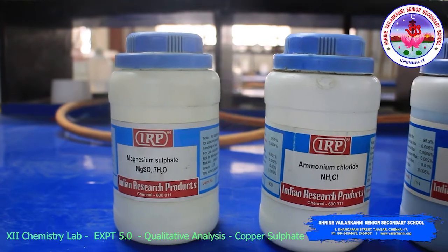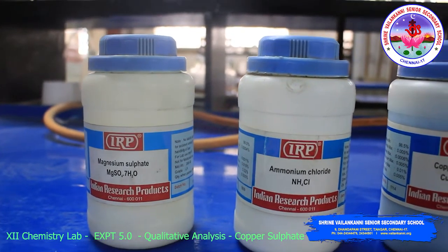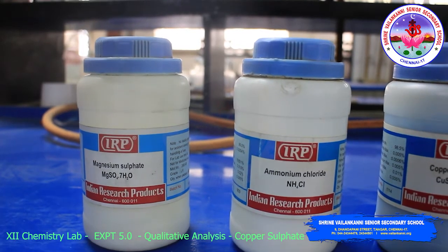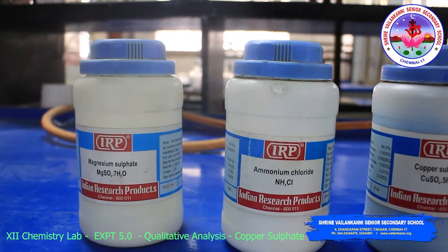Students, we will perform these salts. Usually in the examination we don't tell you which salt is given; you have to identify it with the help of the systematic procedure.